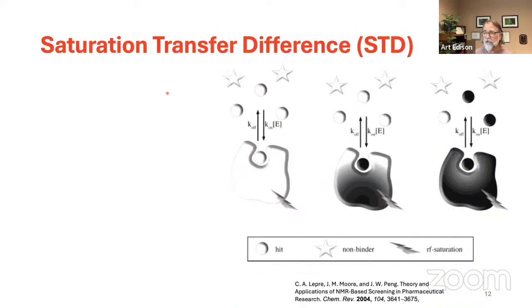So now I'm going to just tell you about some of the techniques that we can use to study these things. This is work in progress right now in our lab, but it's fairly interesting and straightforward. And I think it's important for you to be able to know about these kinds of things. So saturation transfer difference is a technique.